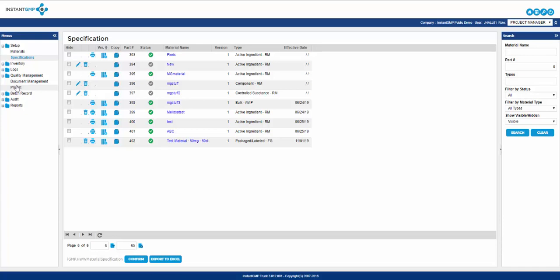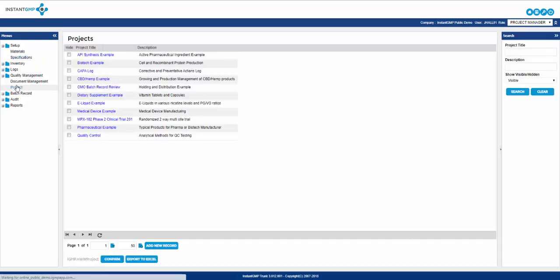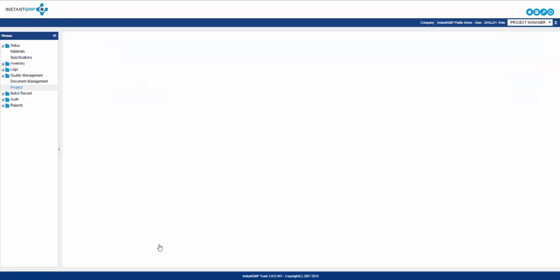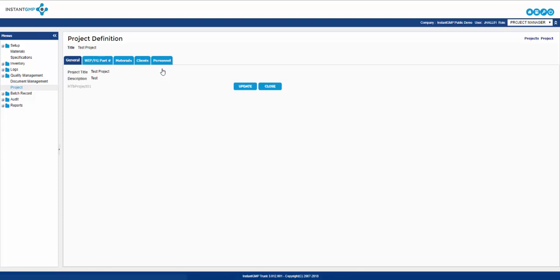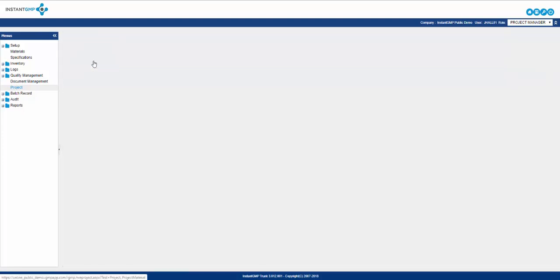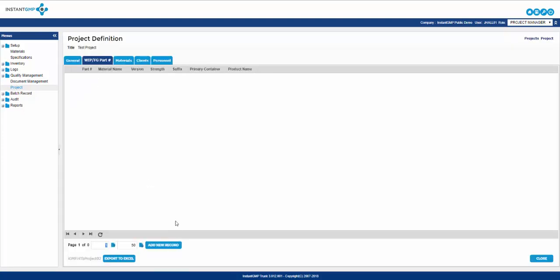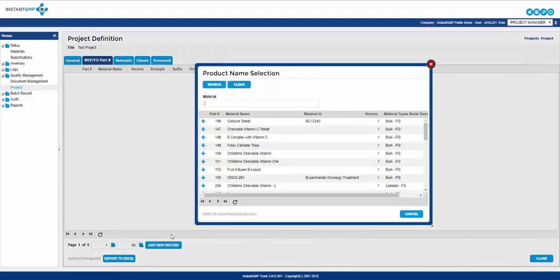Now that we have created materials and specifications we need to organize them into a project. A project is a high level way of organizing final goods or WIPs, materials, clients, and personnel. Final goods and WIPs are a necessary entry to make in a project because when creating an MPR, the first distinction the author must make is selecting a project. It is from the project final good WIP tab that you select the product this MPR will create.